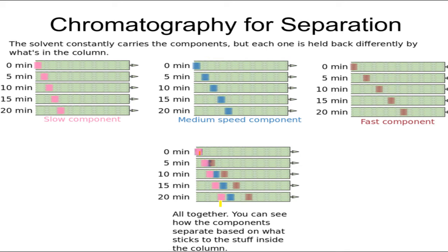Now, a lot of this depends on the solvent used. Some solvents will carry this thing even faster than this one. It can also depend on what kind of powder or sandy stuff you're packing it with. Some sandy stuff you pack it with will get this thing faster than all the others. A lot of different possibilities. And they have many, many different, what they call protocols for separating various kinds of components. But the basic idea is there.